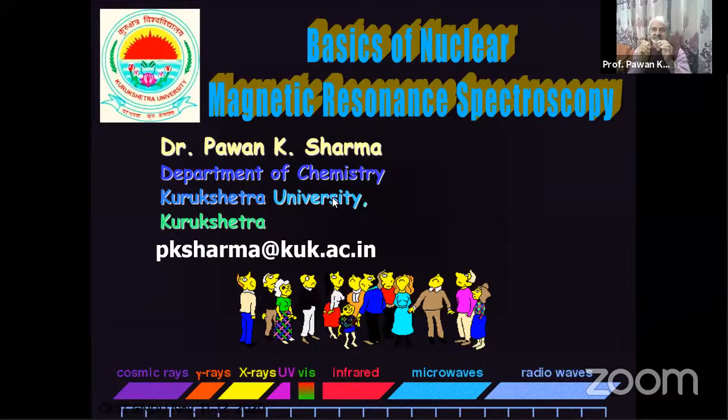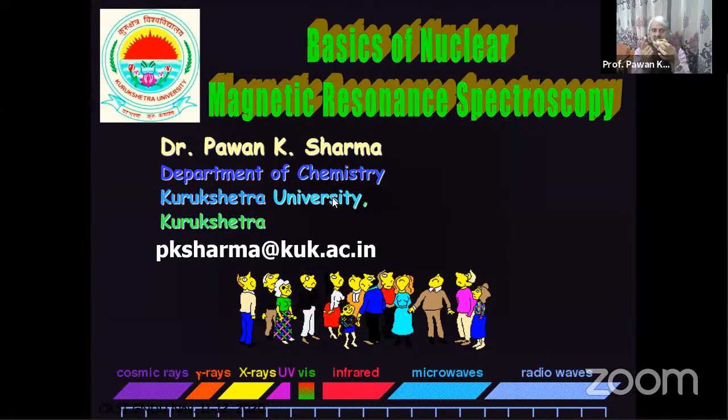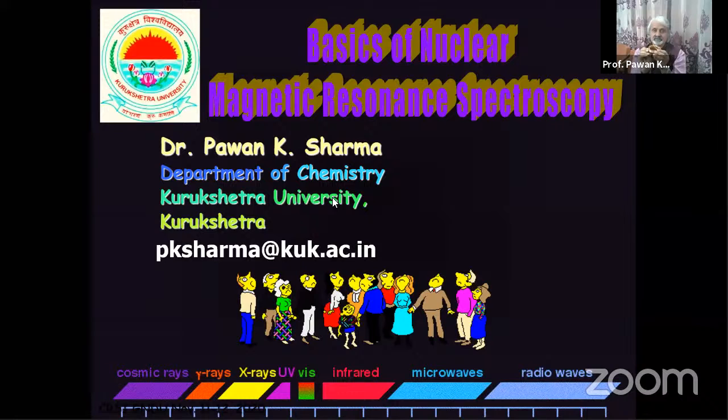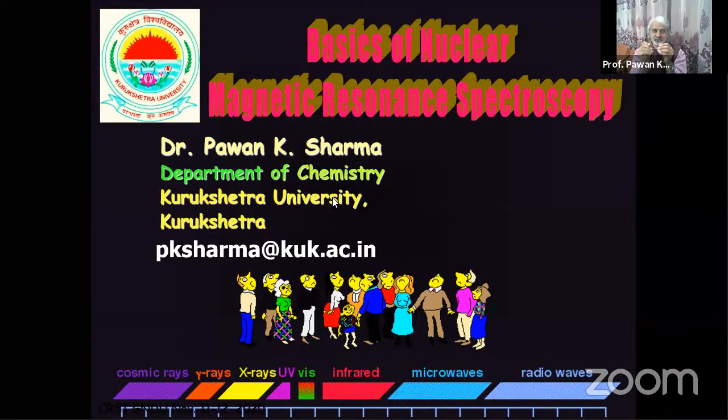Let us say that this ring represents the direction of circulation of electrons. I gave you the animation showing the electrons' motion is actually different, but for the purpose of understanding, you can think of this as the ring around which the electrons circulate.